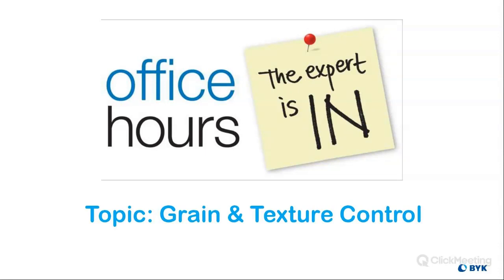Next question from Anna. Thank you for shortening your name. She asked, hi, Corey, is color, gloss, and texture given in each measurement? If so, how is the texture defined, and what angles is the gloss measured at? Gloss is measured at 60. Yes, all of those things are given in one measurement. One click of the button.